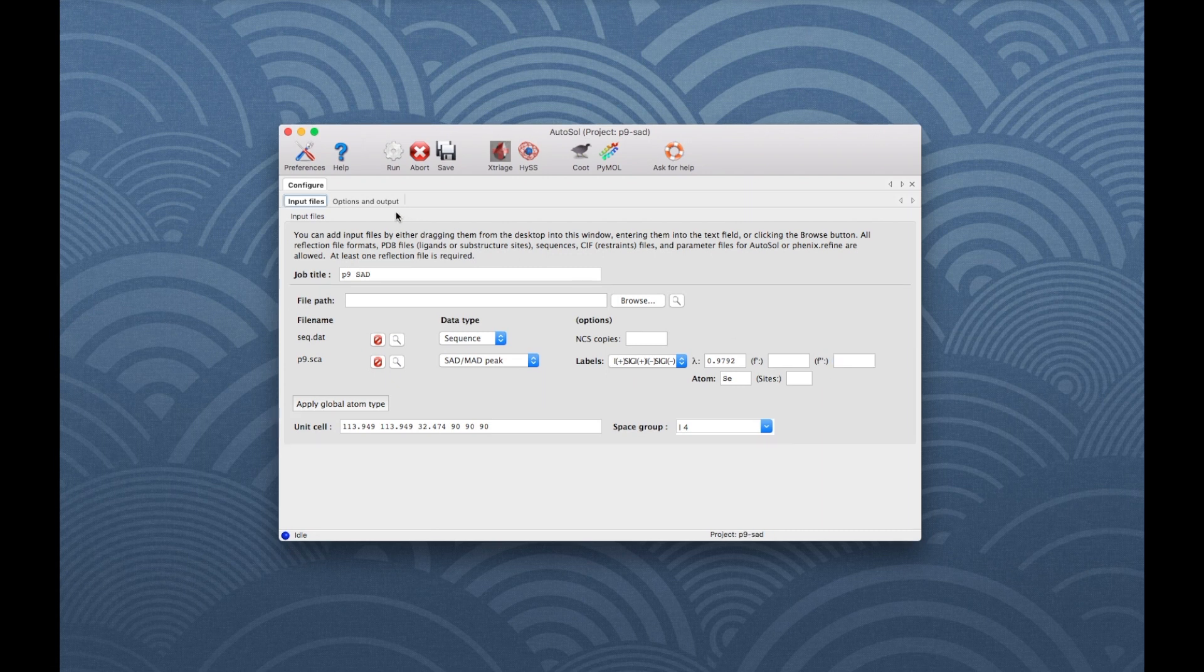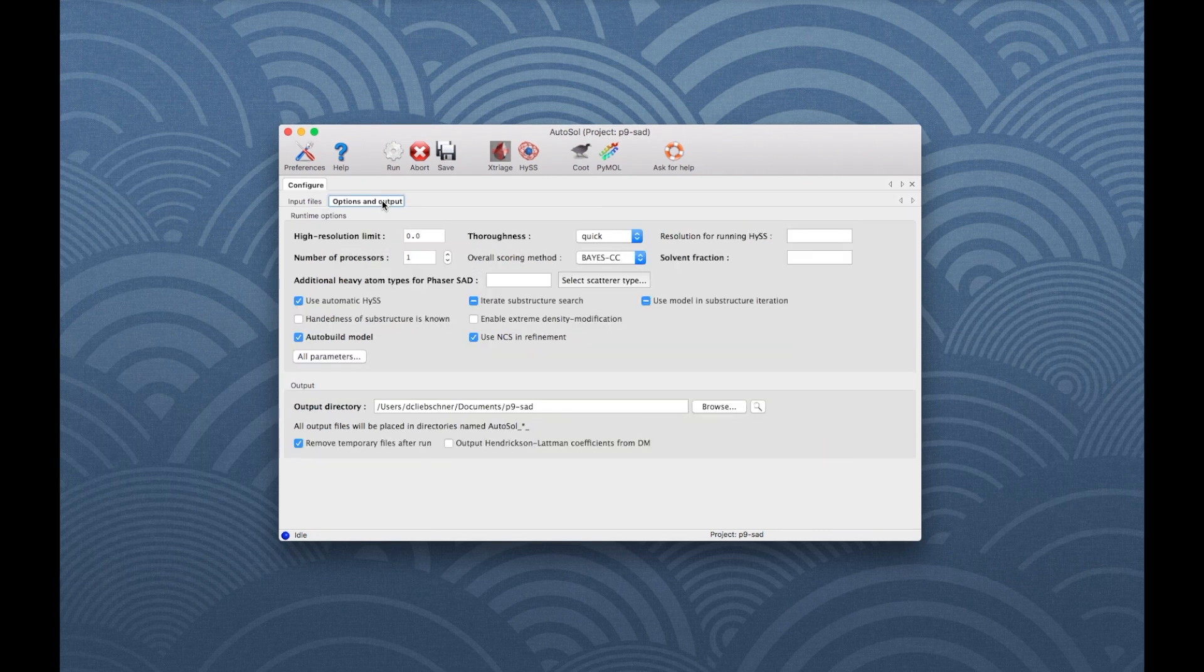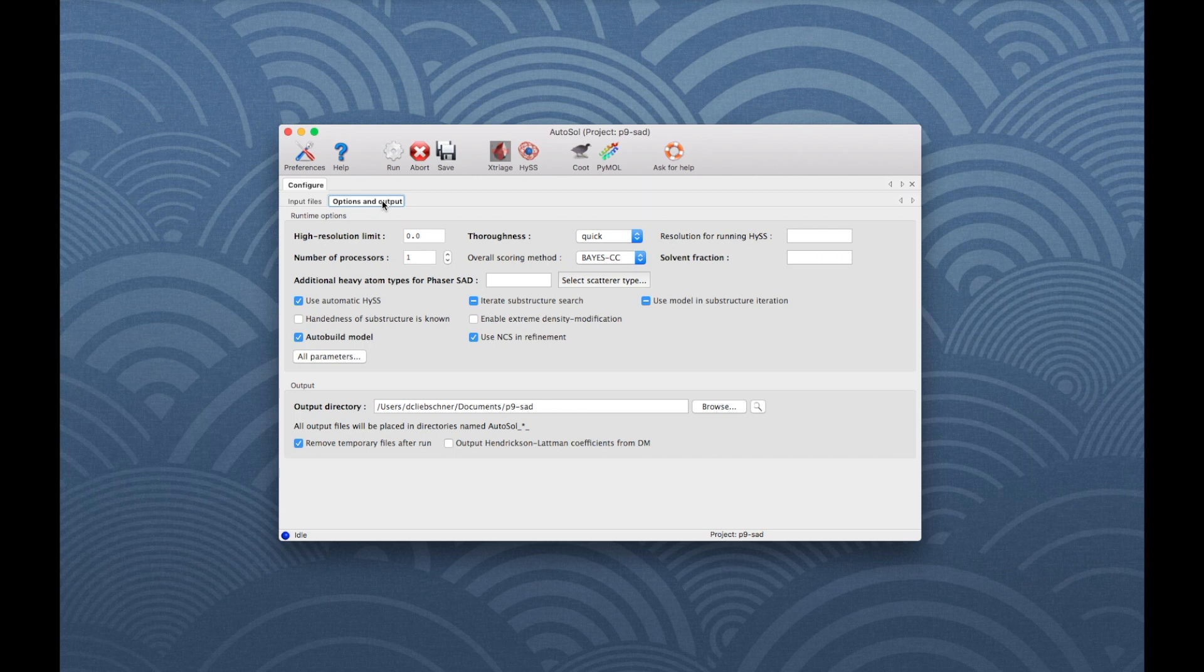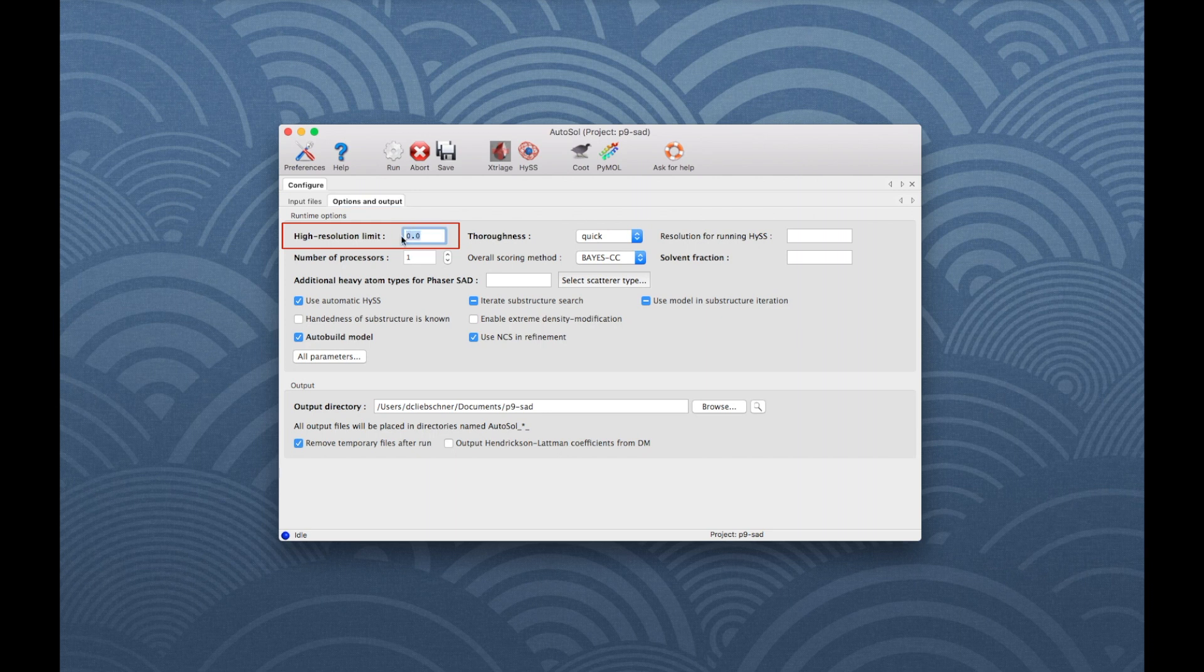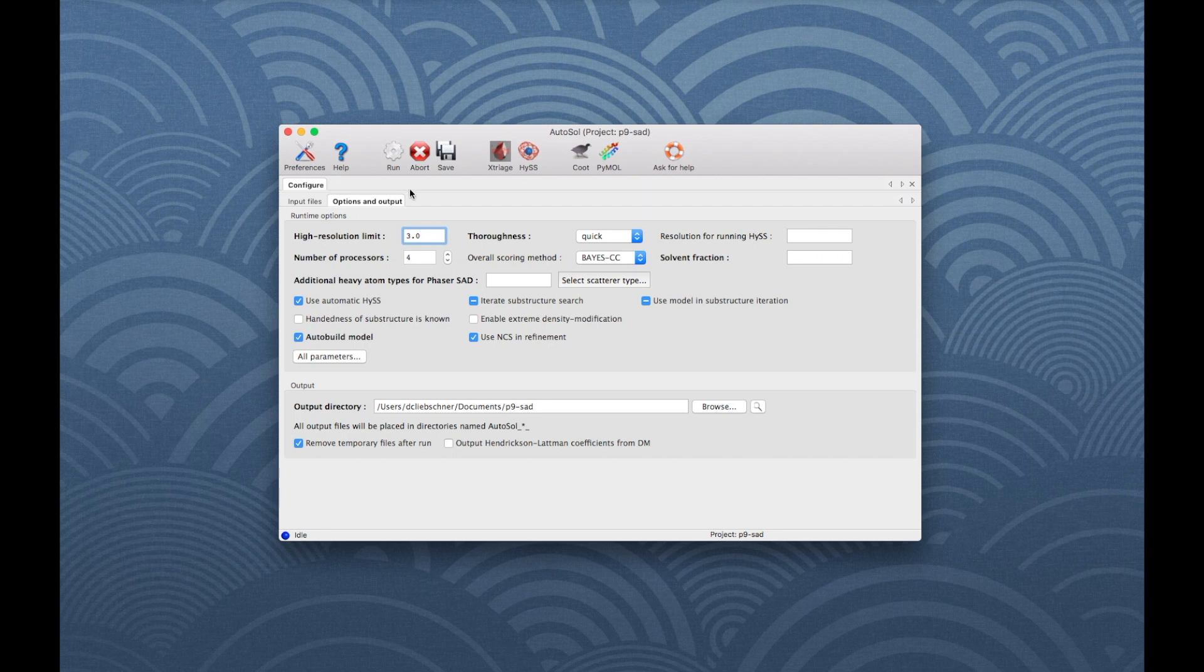Then click on the Options and Output tab. Default options are typically fine, but to speed up the runtime of this tutorial, set the high-resolution limit to 3 angstrom and the number of processors to 4. Then go to Run and click on Run Now to start the program.